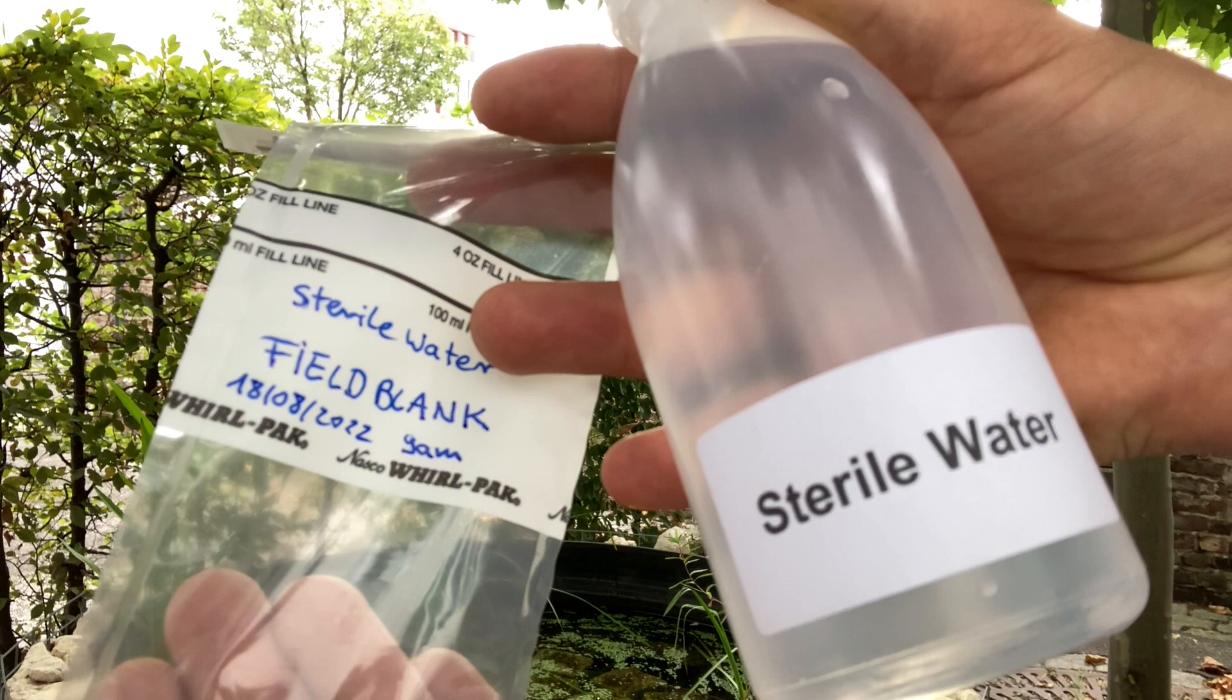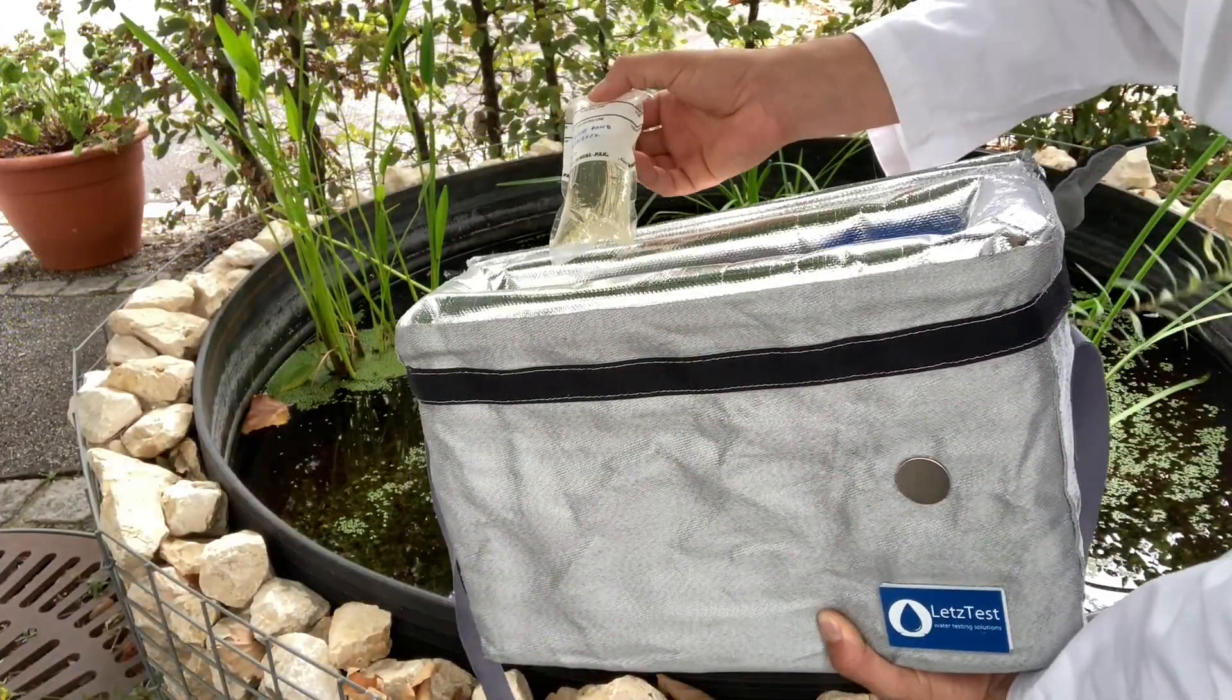For quality control, we suggest you collect sterile water in the field using the same procedure, called the field blank. This sample will also be tested and must have zero bacteria. If it does not, your sampling technique must be improved and your results are not valid.